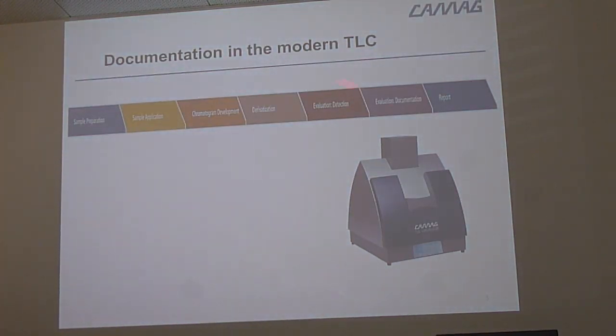So in this field, we are at the evaluation and documentation. So we document, and with VisionCATS or with VideoScan early on, you could also quantify. So there was also an evaluation.